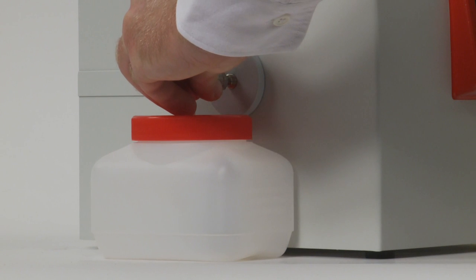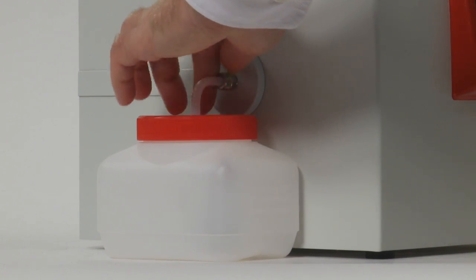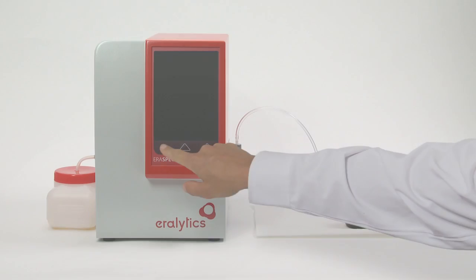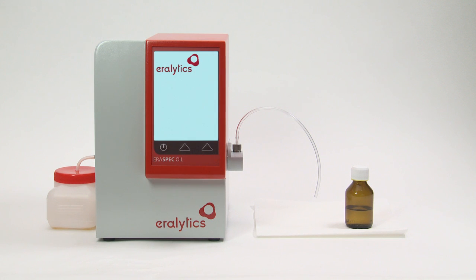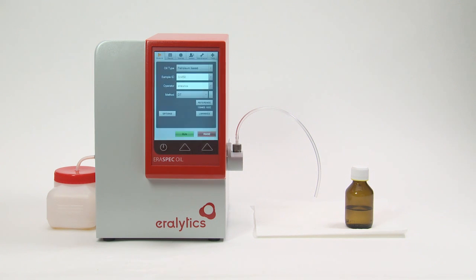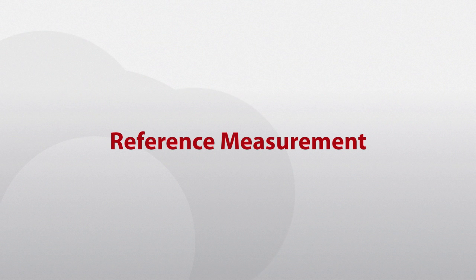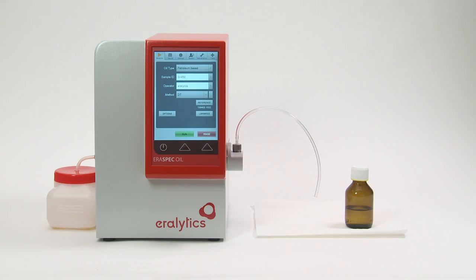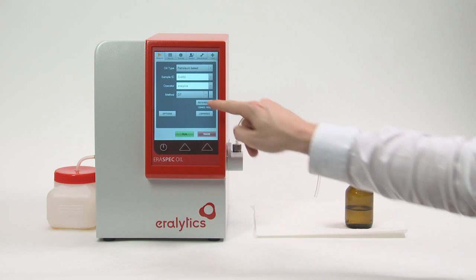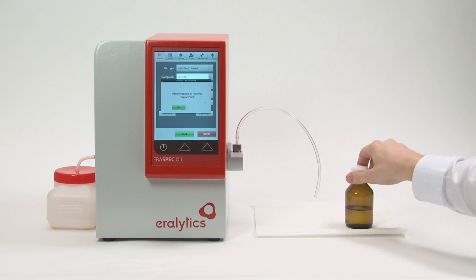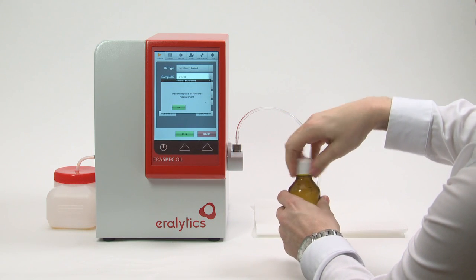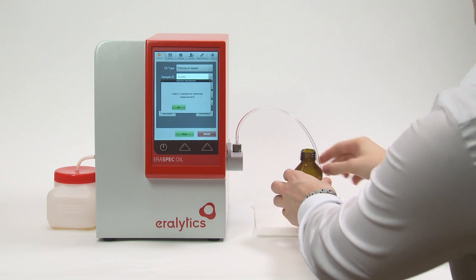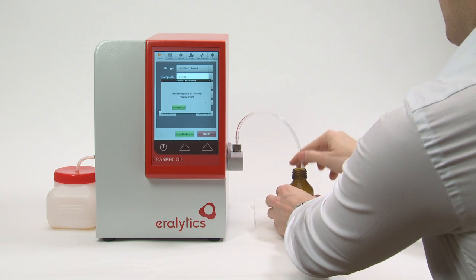Switch on the analyzer by pushing the power button on the front. Before the first measurement, after the instrument has been turned on, a reference measurement using n-heptane must be made. Click the reference button, insert the inlet tube into the n-heptane container, and click OK.